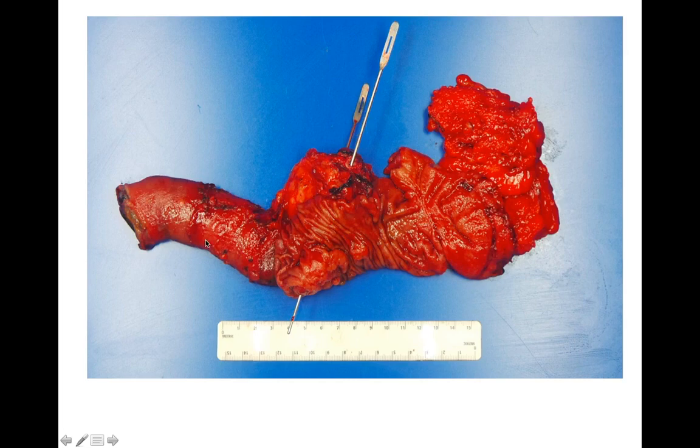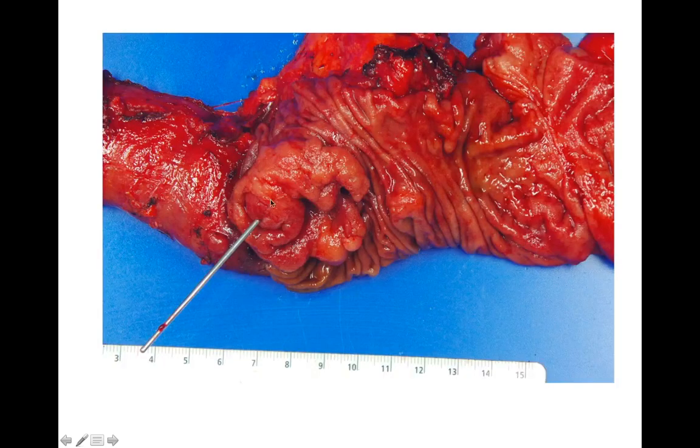And then, so we have another Whipple specimen here. You could see here's a portion of the duodenum. I think it looks like it's been potentially opened or disrupted. I'm not quite sure. Or maybe the picture was taken after it's been partially opened. Maybe here's some stomach over here. And here you could see it's probed through the bile duct and then the pancreatic duct as well. And right over here on the close-up, you could see that the ampulla of Vater is obstructed by this massive polypoid lesion.